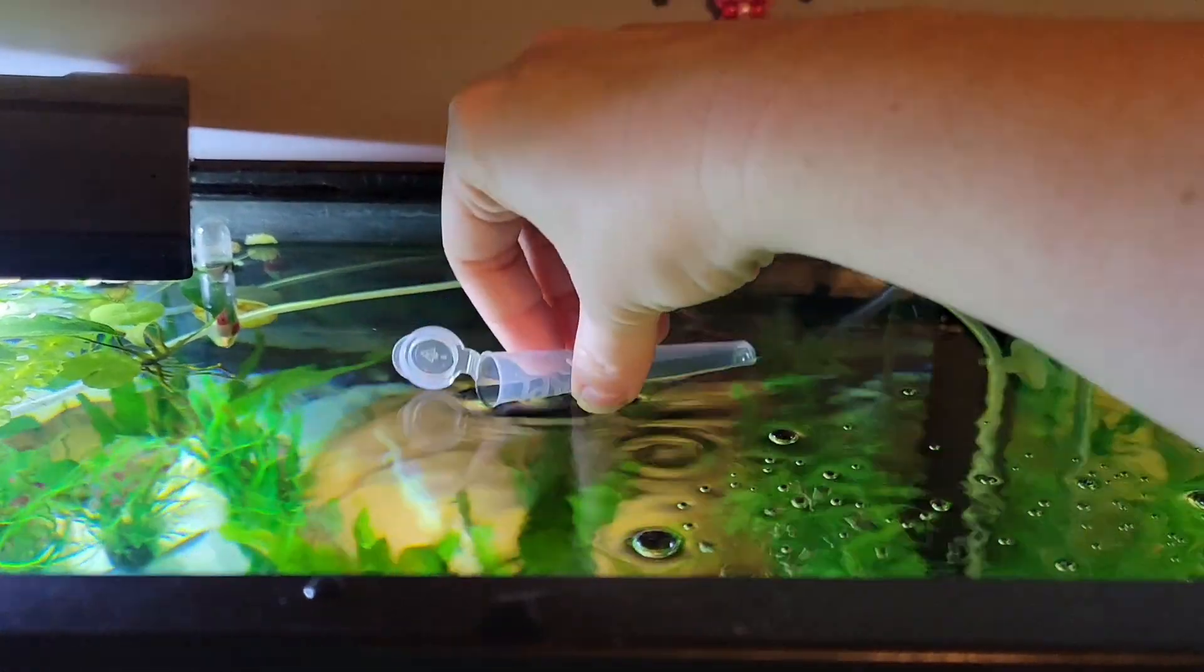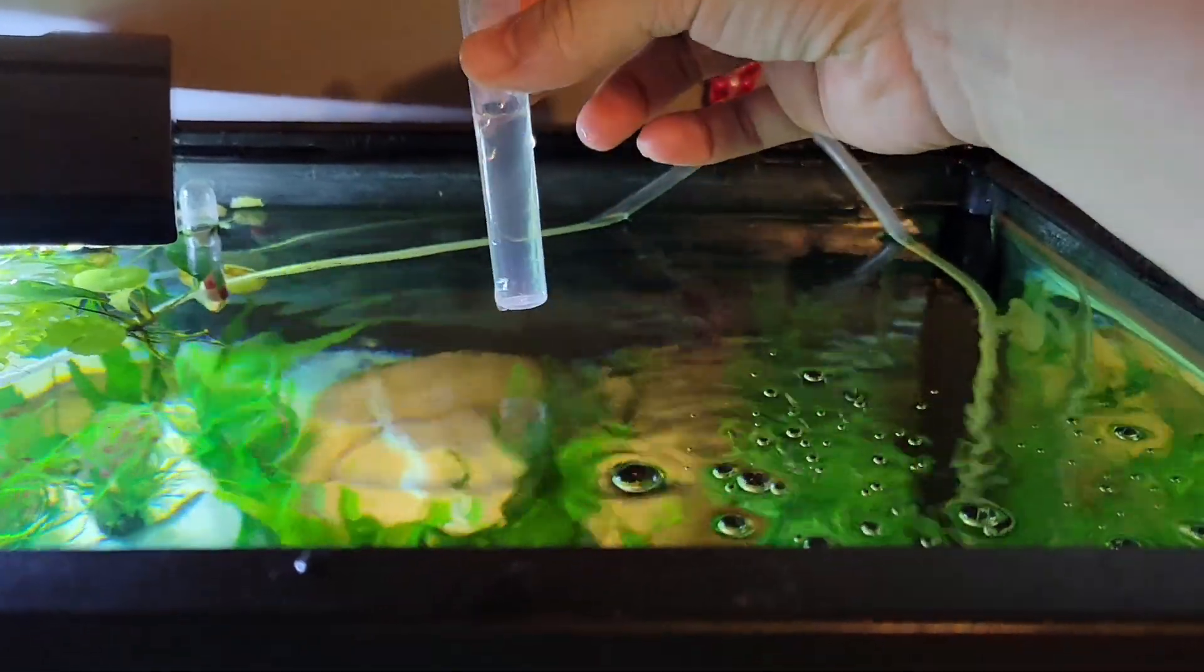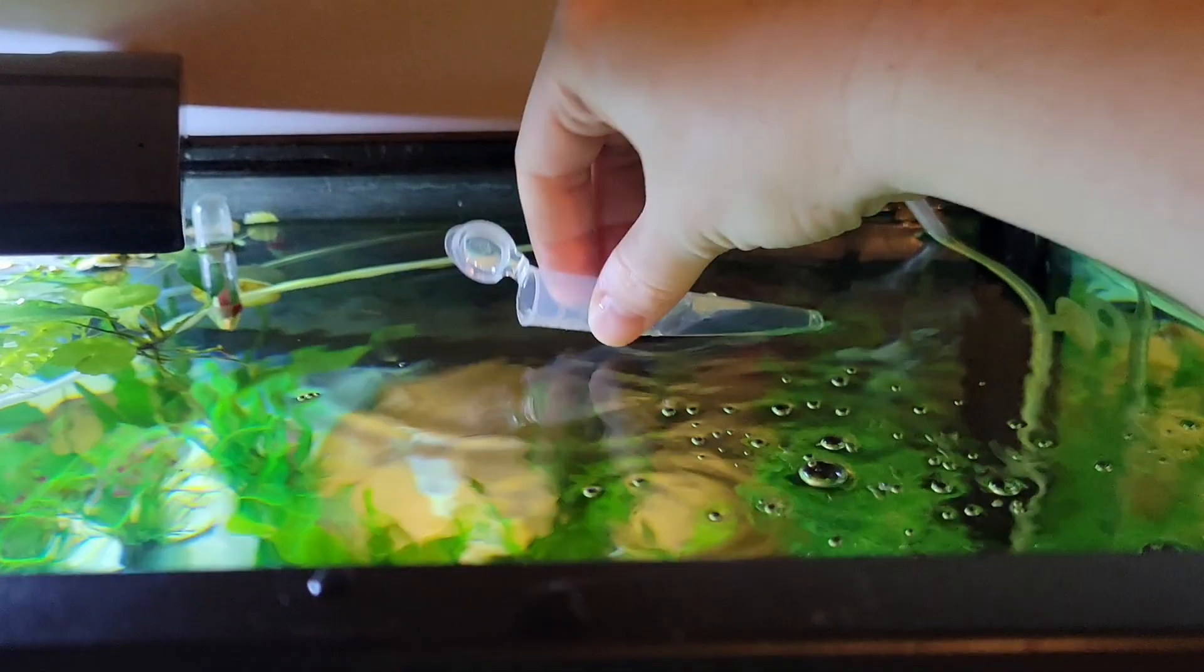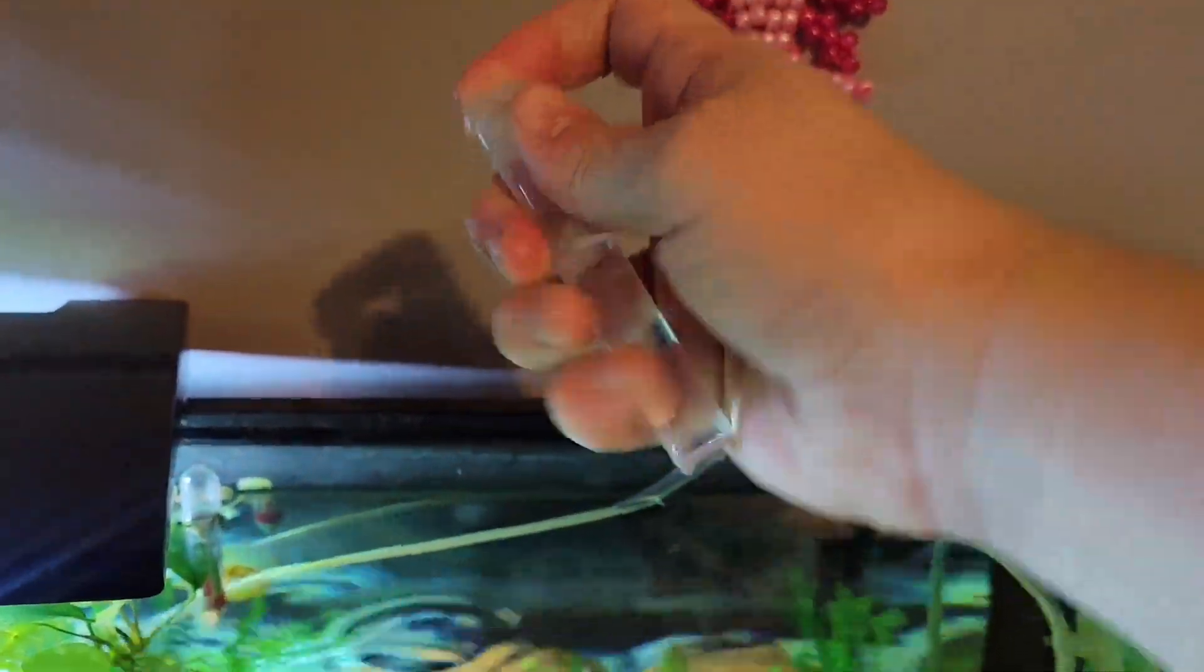So to begin, you are going to fill the little test tubes that come in the kit with your aquarium water. You only fill them to the line marked on the test tube. You can go ahead and close the cap once you get it filled.